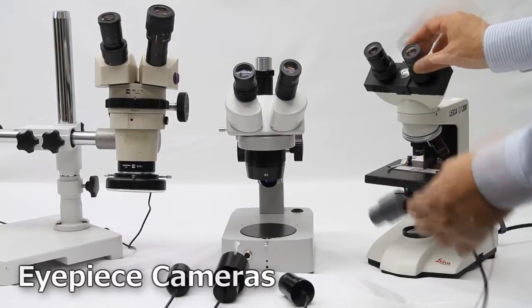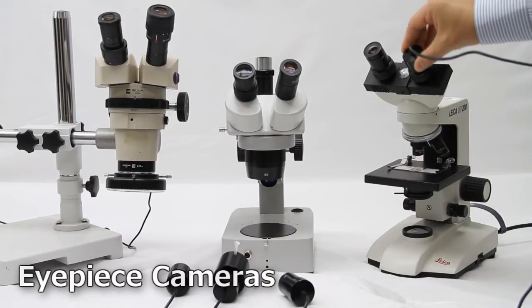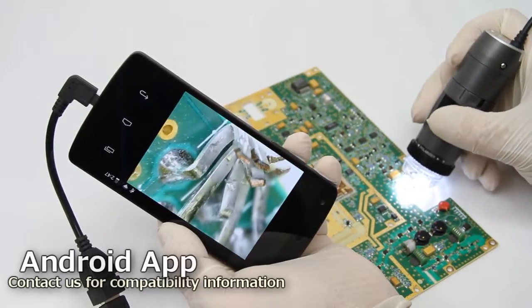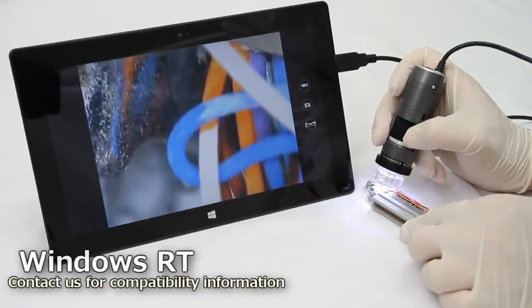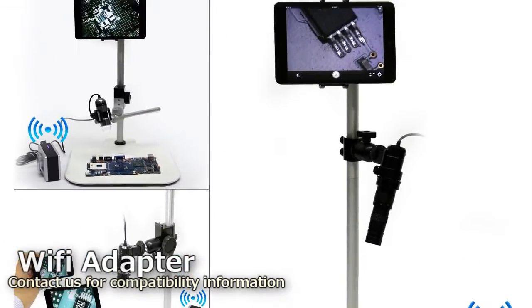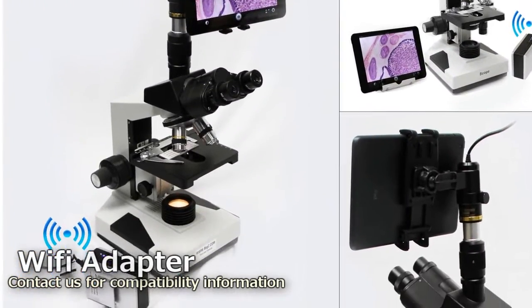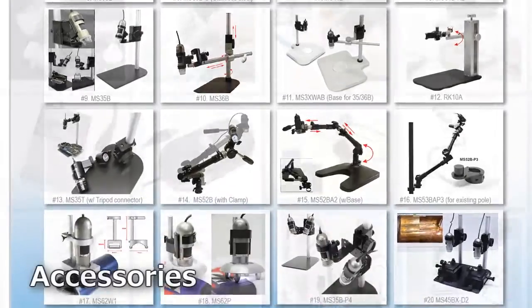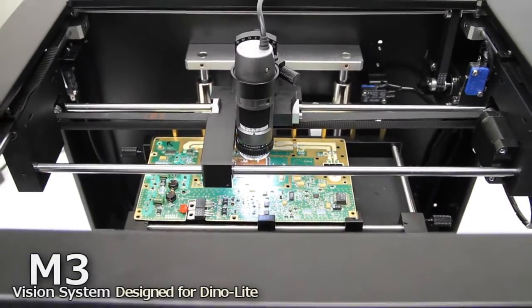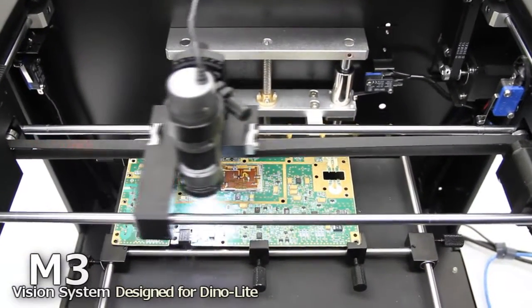DinoEye eyepiece cameras slide directly into the eyepiece slot on a traditional microscope. You can connect DinoLites to compatible Android devices, Windows RT tablets, and even a Wi-Fi adapter that displays a live view over a close Wi-Fi stream. There are a huge variety of DinoLite accessories to choose from, including many types of stands, stages, lighting and more, like the M3 and M5 machine vision systems.